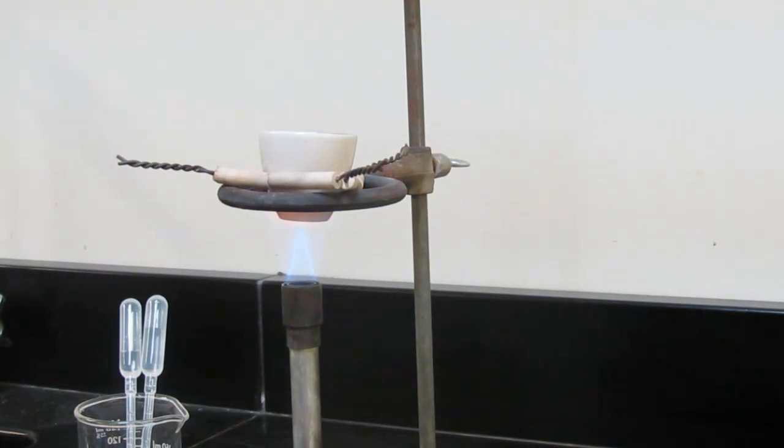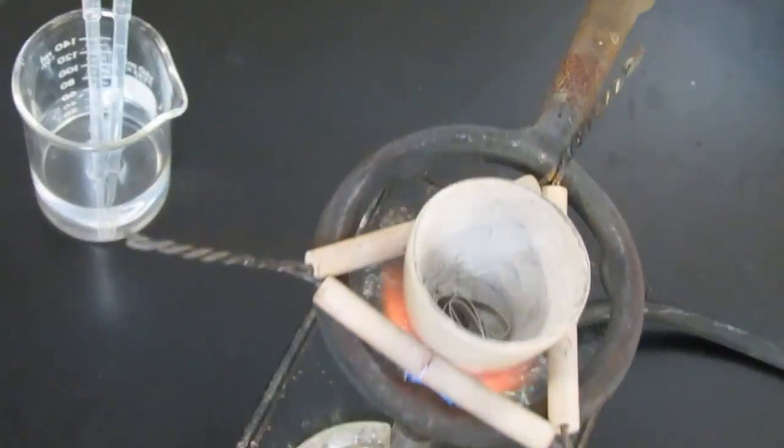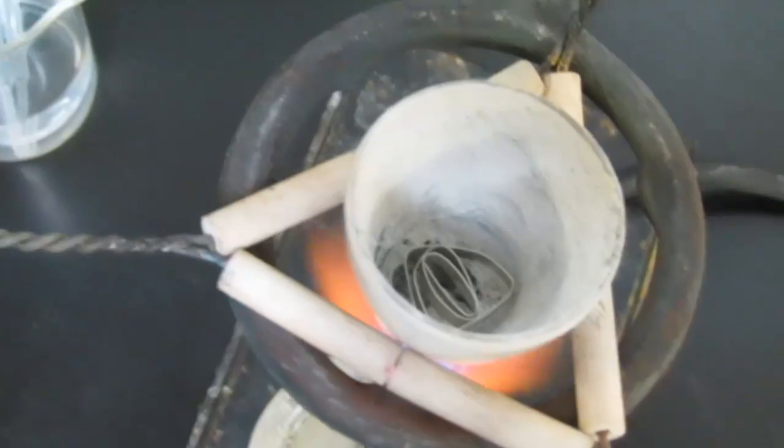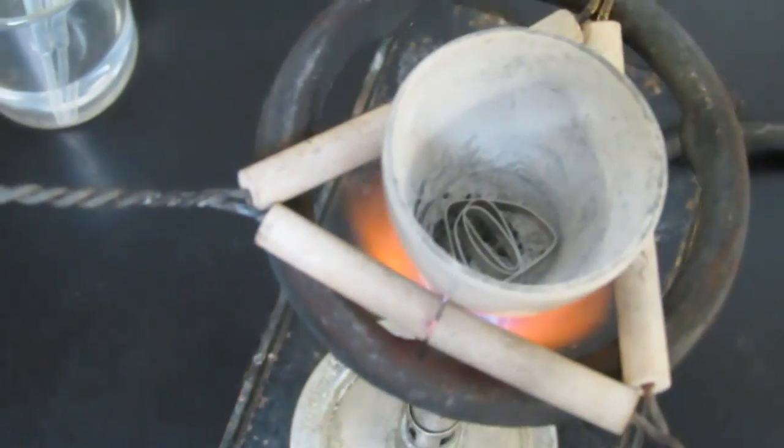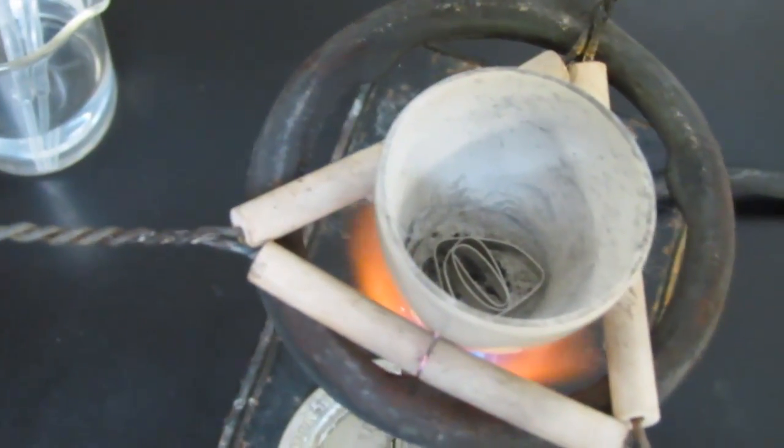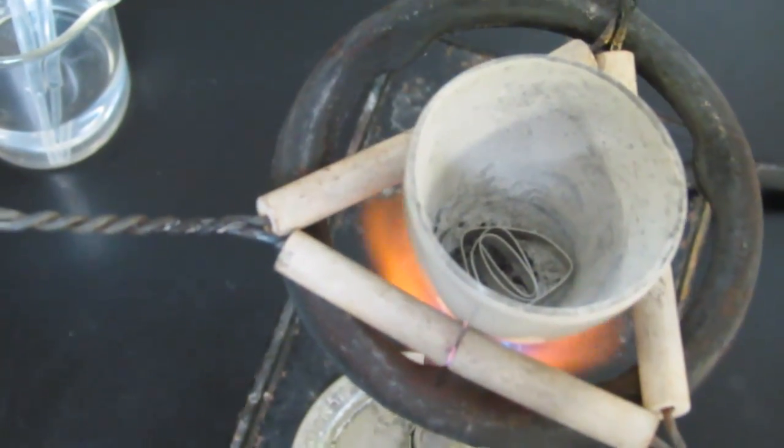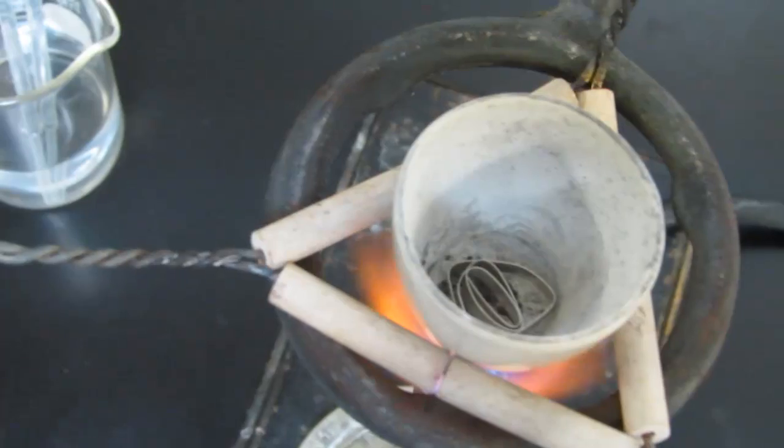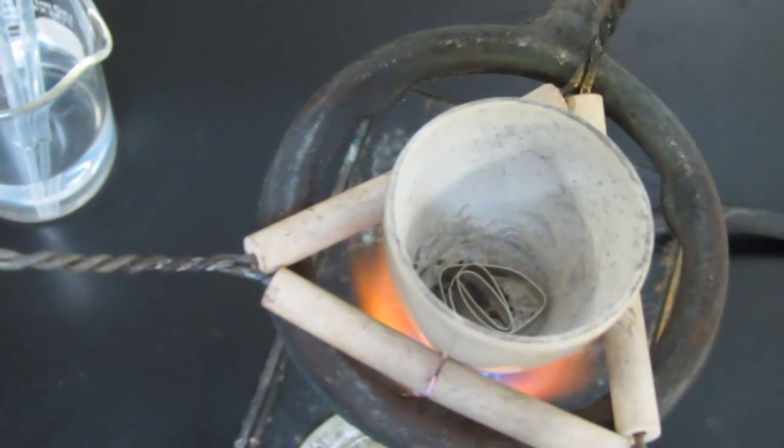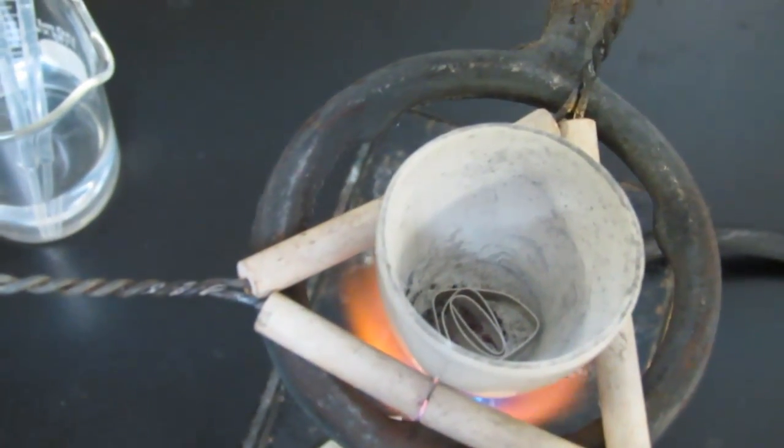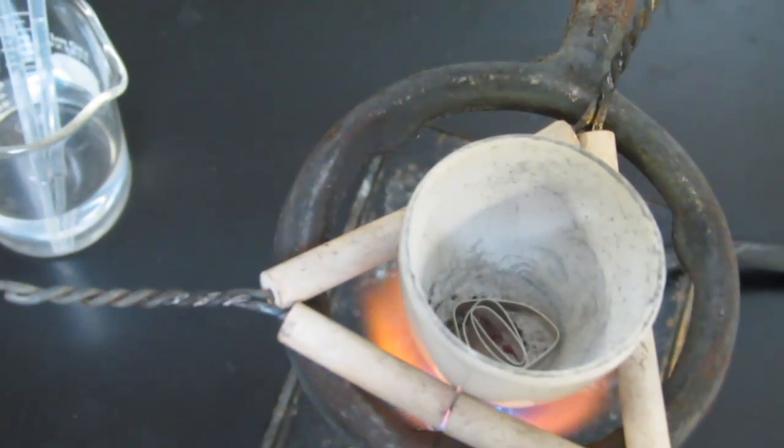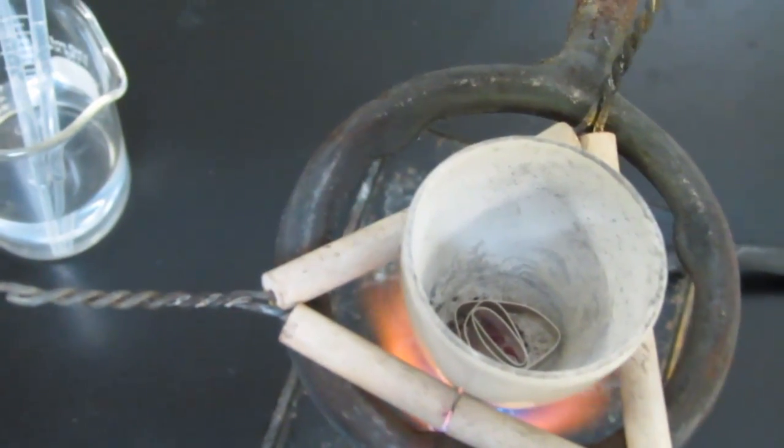And we'll allow that to heat. Let's see if I can manipulate my camera without causing too much of a problem. We'll look down on what we're doing. And you can see the magnesium in there as it's heating. And before long, that magnesium will react with the air around it. But we have to get it nice and hot first. And when it reacts, it begins to glow. And when it begins to glow, we'll go ahead and put the cover on in case any of the product wants to escape. We want to keep it inside that crucible.